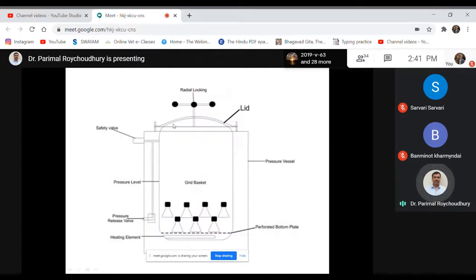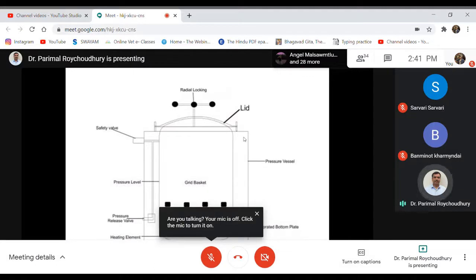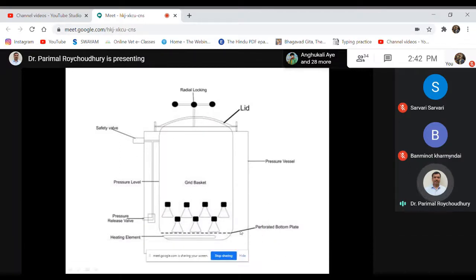So if you can see a schematic diagram, how it works is very simple, just like a pressure cooker. Usually these machines are made of very thick wall and high strength metal container, because they have to withstand the high pressure. At the bottom, a heating element is fitted, and above it we have a perforated platform where we can keep our media bottles and whatever you want to sterilize. And then we switch it on, and sufficient water we have to put inside so that it doesn't dry off, and then the steam will rise, but steam cannot escape.